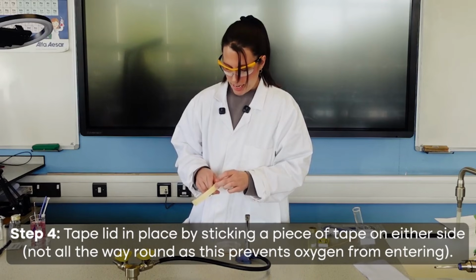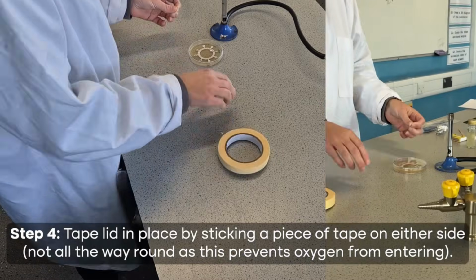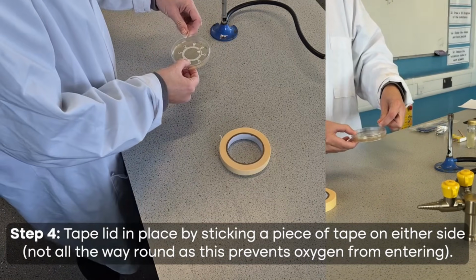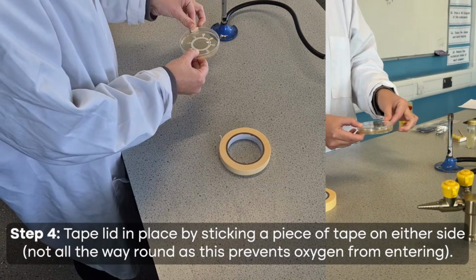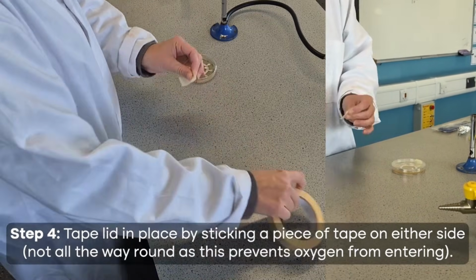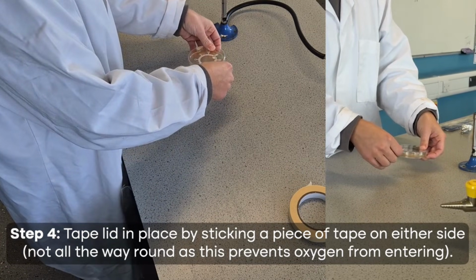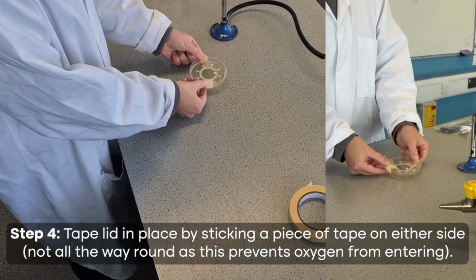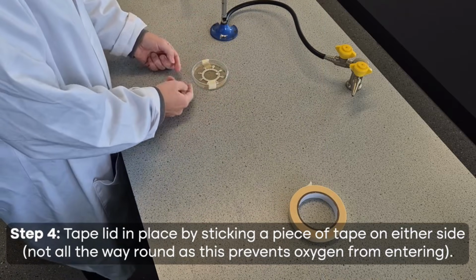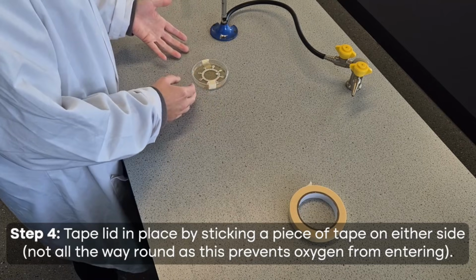Final step then is we will tape our lid down so it can't come off, but you need to make sure you are only putting a piece of tape on either side. Just like this. And that's enough to keep the lid on. But if we put tape all the way around, then oxygen can't get in. And that is then when you might grow anaerobic bacteria.